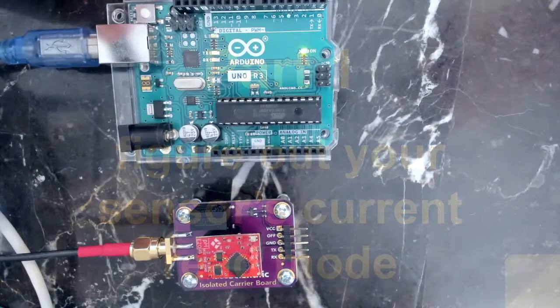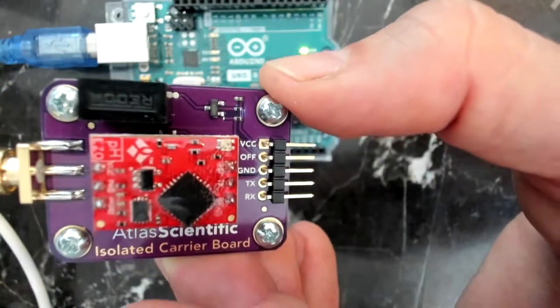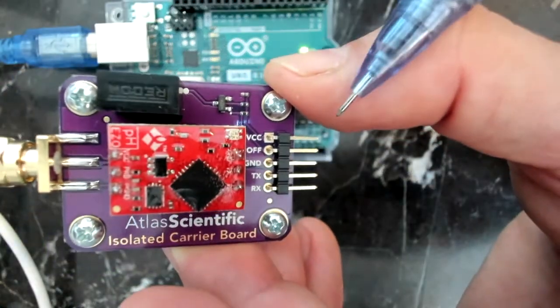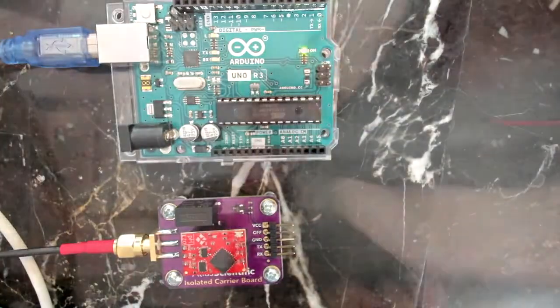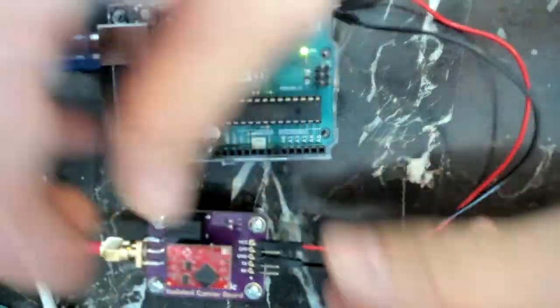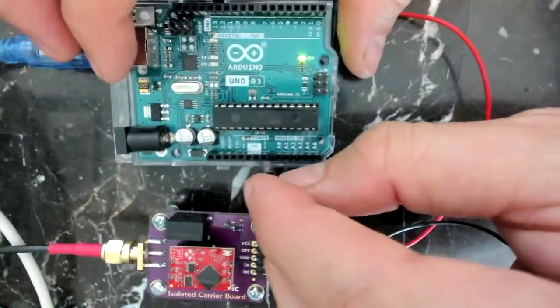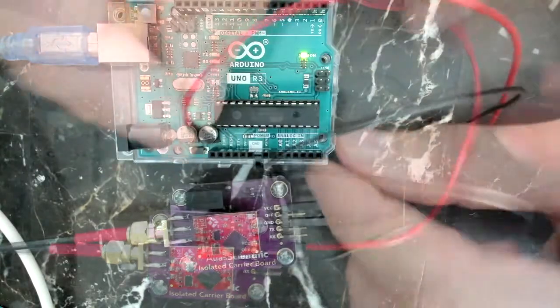The first thing I did is I plugged in my sensor. Now I know you might not have the carrier board, so I'm going to read all the pins out as we work. Black to ground, red to VCC, and I'll plug in black to ground on the Arduino.